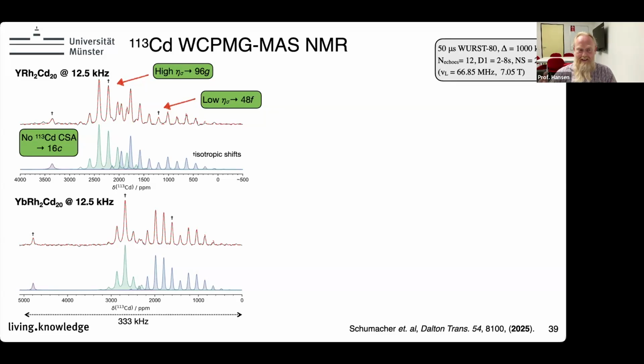But this is unfortunately not so easy for phases that contain intermetallic elements. There are lots of effects that need to be taken into account. And you can do the same here for the ytterbium phase.